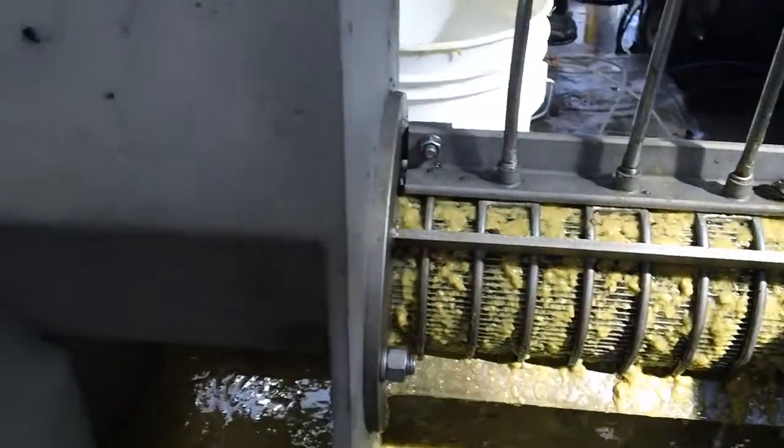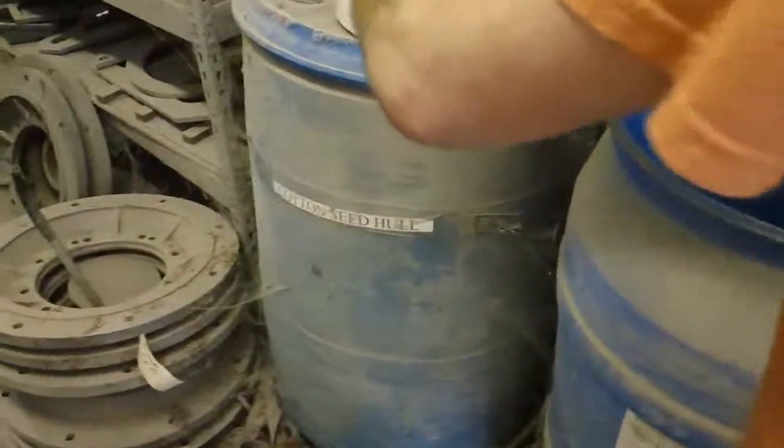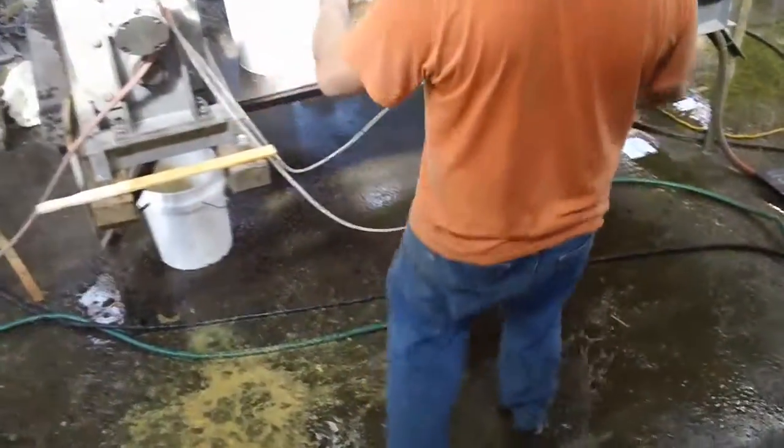Well, we can get some wood fiber. Here you'll see we try to keep some press aids on hand. I think it's in this. Yeah. We have some wood fiber. We're going to go ahead and put that in. We don't know at this point if it's practical for you to do that, but since we've achieved nothing at this point, we can't hurt anything. Sprinkle it in.